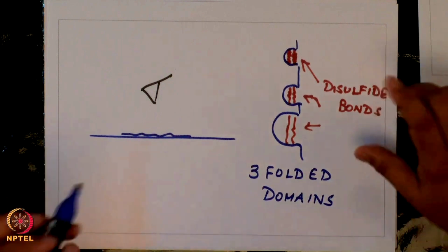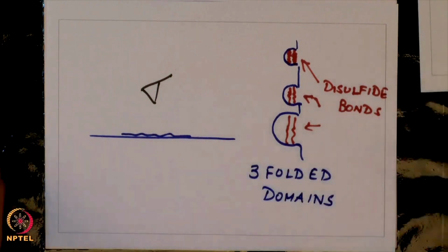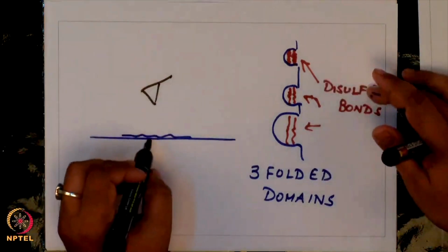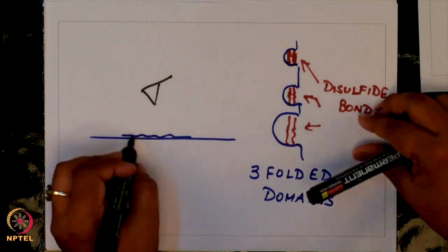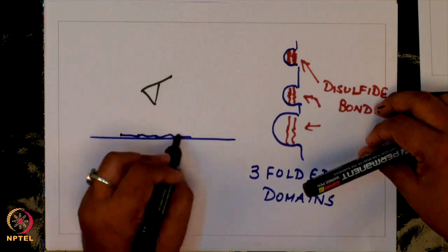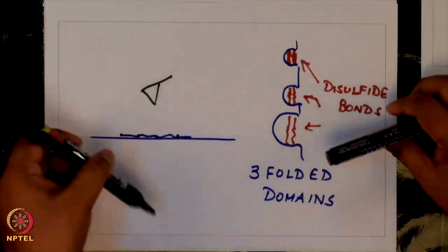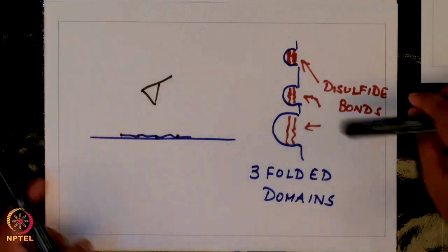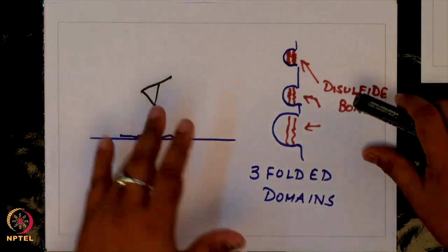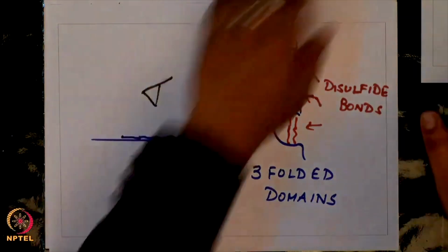Let us assume your tip, so where the tip touches the protein is not in your control. The tip might hit the protein from this point, from this point, from this point. So, you have no control where the tip actually touches the protein. Imagine that the tip actually came in contact with the protein at some point of the protein. So, what will happen in our previous curve?